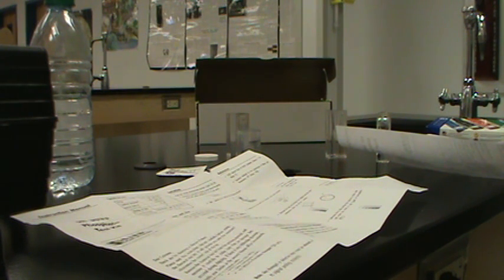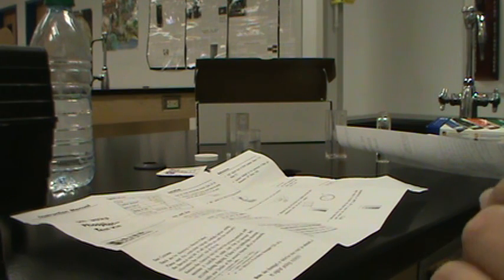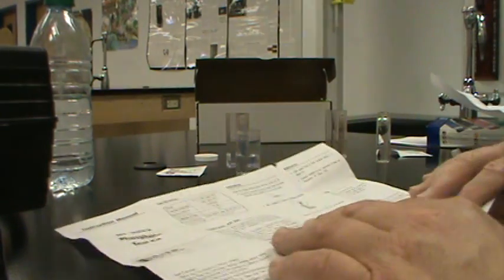Welcome to the first of our water quality tests. As I indicated in the previous video, we're going to be doing the phosphate test and the nitrate test first. Let me just read you what it says in our information.